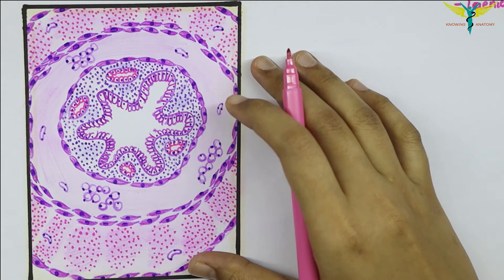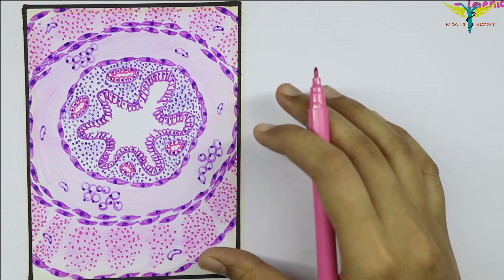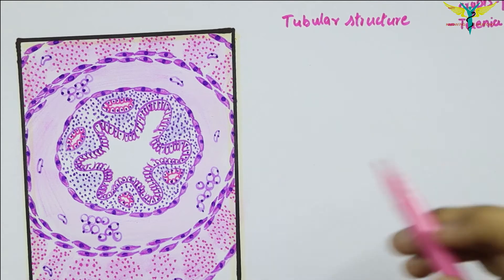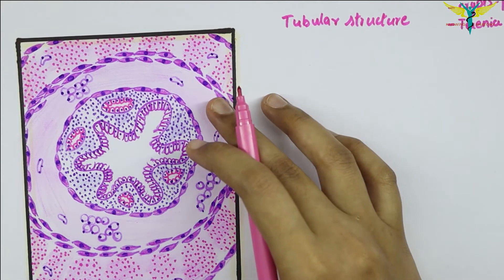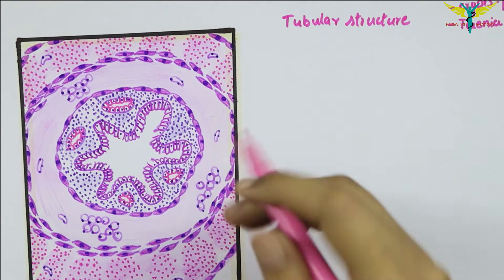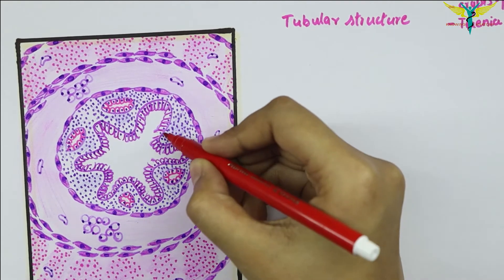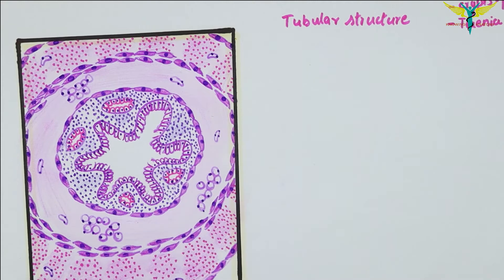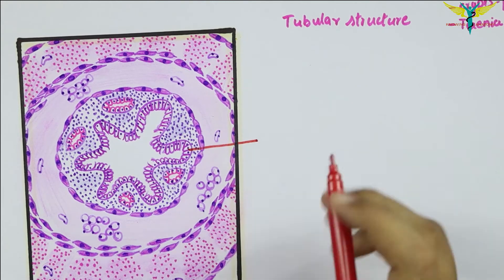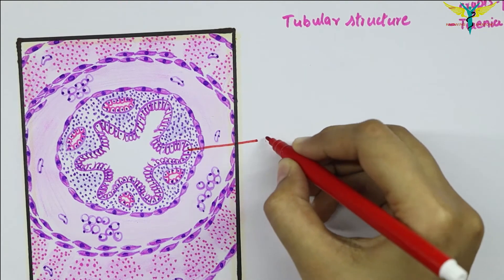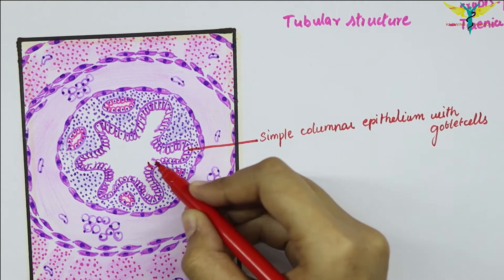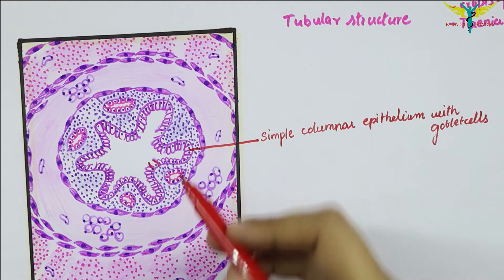The vermiform appendix is the narrowest part of the gastrointestinal canal and is a tubular structure. The innermost layer of the whole GIT is the mucosa, and in the vermiform appendix the innermost layer is also the mucosa. The innermost lining of this mucosa is lined by simple columnar epithelium with goblet cells — you can see the presence of goblet cells here.